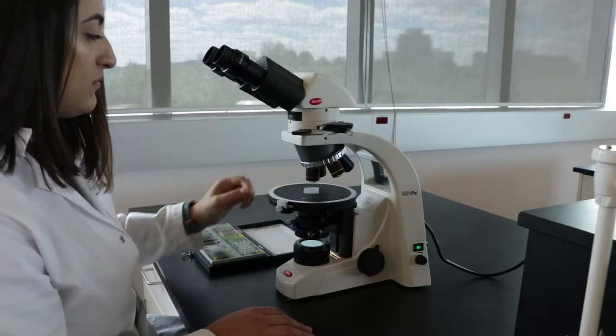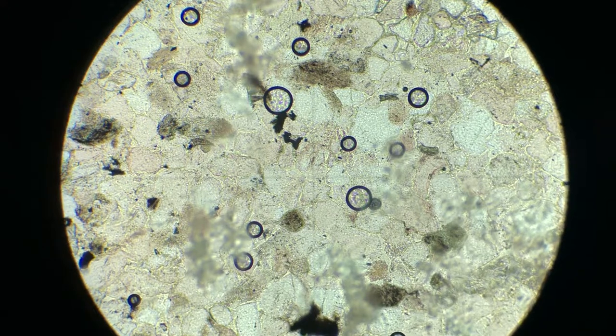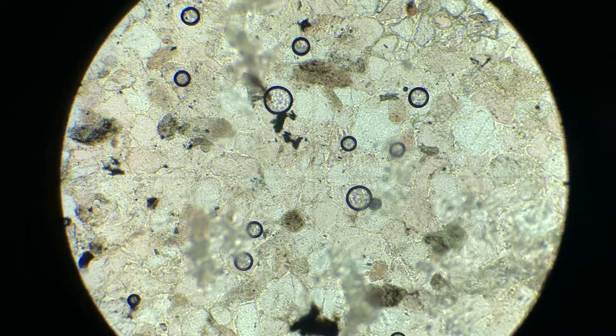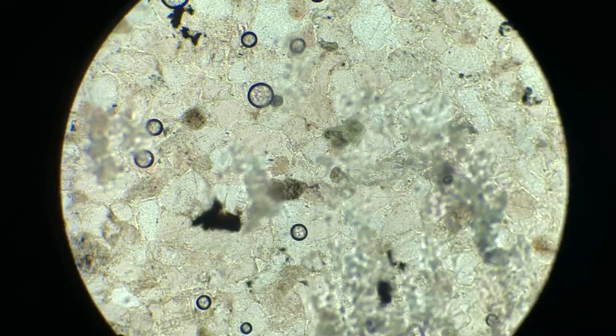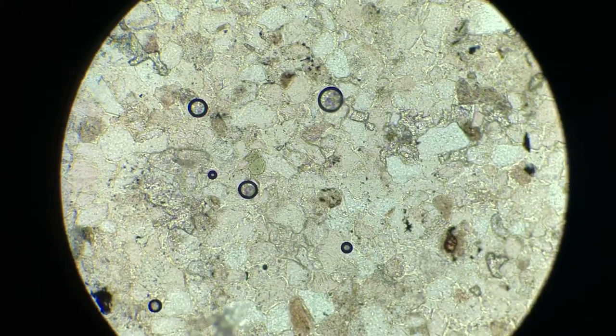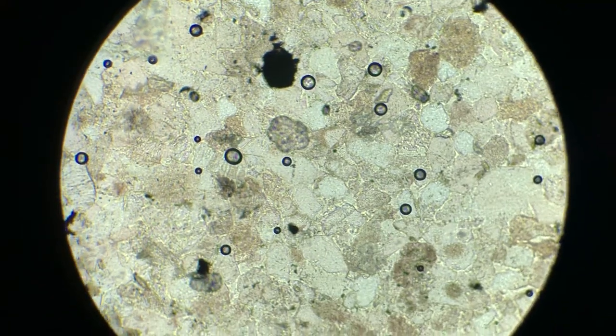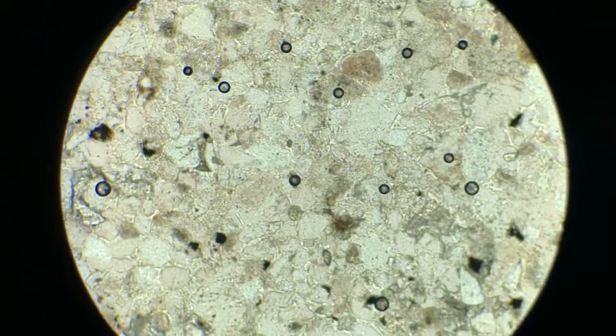Your thin section may have bubbles trapped inside. They look like this. This can happen during the process of making the sections. If you see this in your thin section, ask the instructor, a TA, or the lab technician for help or a new thin section. Alternatively, note this in your thin section analysis.